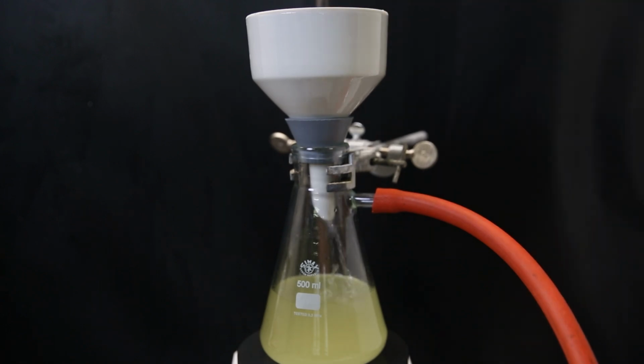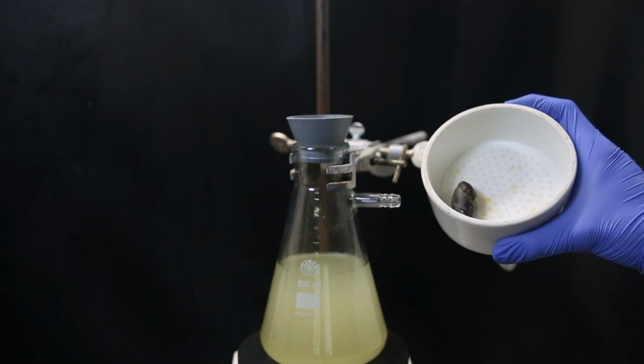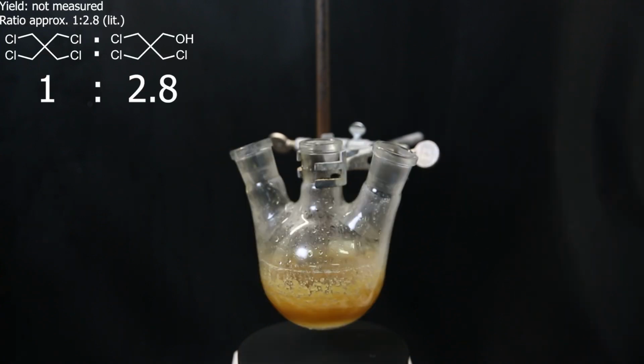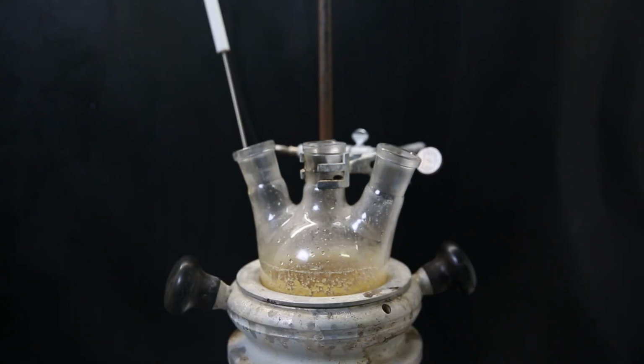The product seems to be very sticky, and it is sticking to the bottom of the flask. Only a very little bit made it onto the filter, but it's okay, and I will just use the flask with the product like this for the next step. So the solid contains a mixture of the tetrachloro and trichloro product in an approximate ratio of 1 to 2.8. But for the next reaction, it is only the trichloro product that is doing something, and the tetrachloro is unaffected.